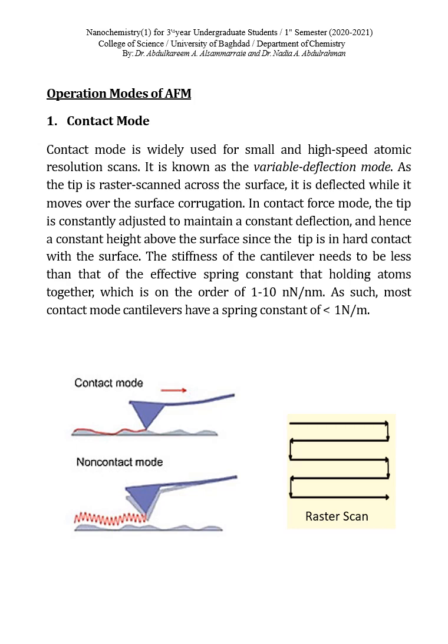بسم الله الرحمن الرحيم. هذه lecture 8 for Nanochemistry 1. احنا نستمر ويا ال identification techniques for nanomaterials. احنا نتطرق هنا إلى two operation modes of AFM اللي هي ال contact and non-contact operation modes.